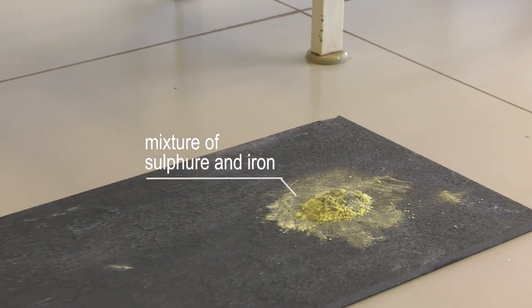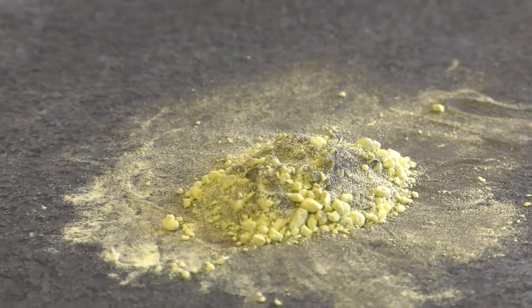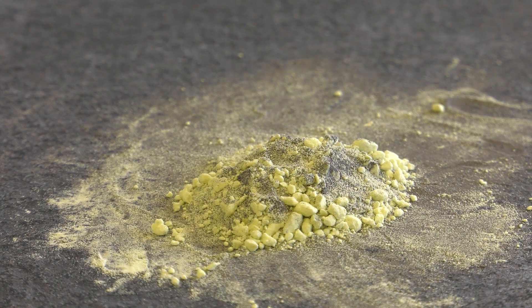For the reaction between sulfur and iron, we need fine iron powder and sulfur powder. On a marble slab, 3 g of fine iron powder is given.